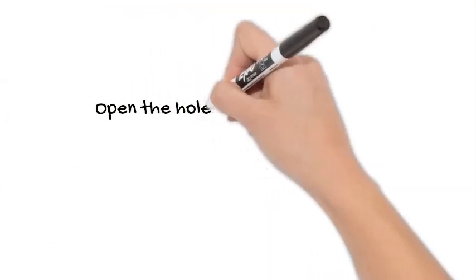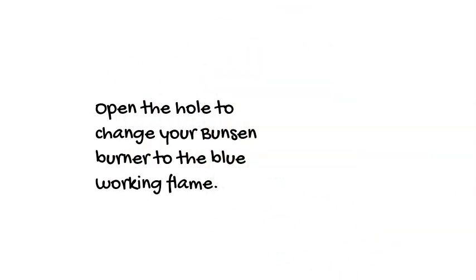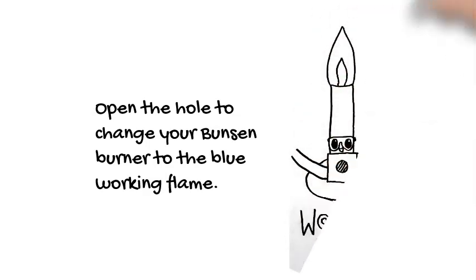To produce the working flame with your Bunsen burner, open the air hole at the bottom of the barrel. This is called a working flame and the flame we usually use to heat things in the lab. It should appear blue in color. However, the working flame is hotter than the orange safety flame.